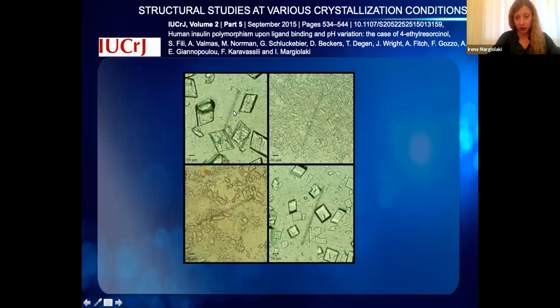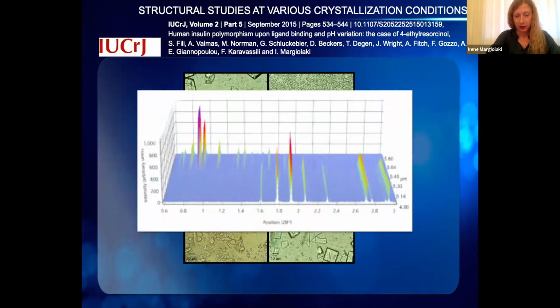The pH has a tremendous effect on protein structures because protein molecules are charged molecules. If we look at 4 out of the 20 prepared samples, already with an optical microscope, we see different crystal morphologies. So we suspected that there are phase transitions, polymorphism, basically. We collected data at ID31, ID22, the high resolution powder diffraction beamline at the ESRF.